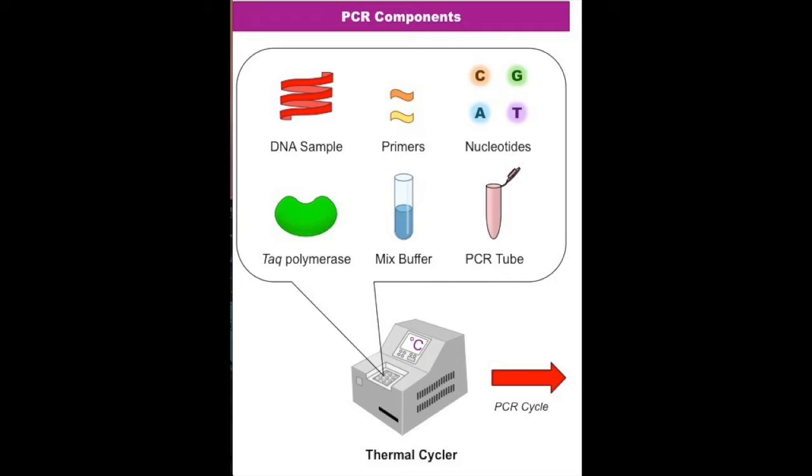This chain reaction facilitates the rapid production of copies of a specific target strand of DNA for testing by cycling through 3 different temperatures. The 4 nucleotides needed to create these copies, A, T, C, and G, are found in the replication medium.